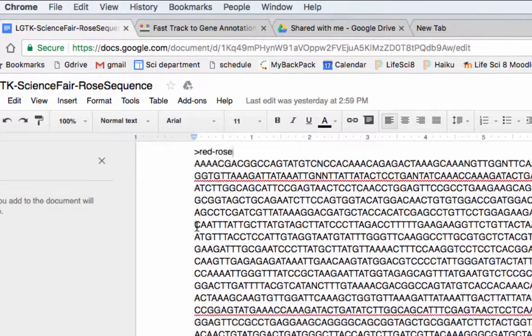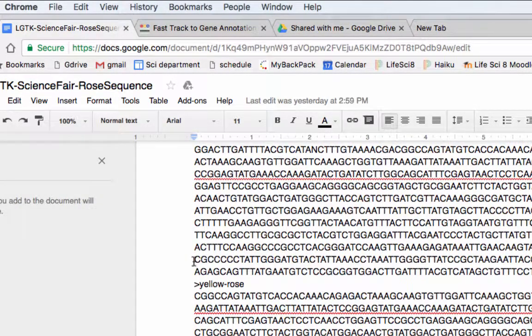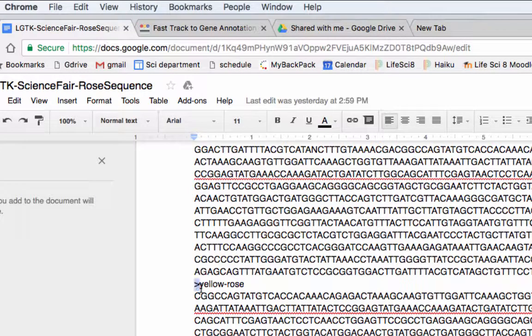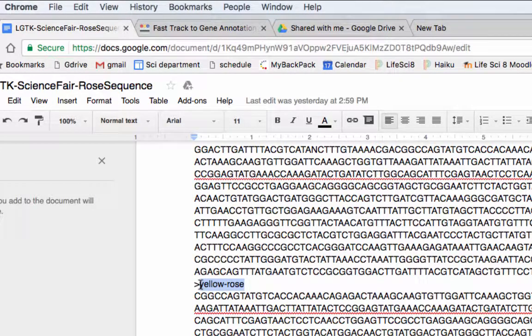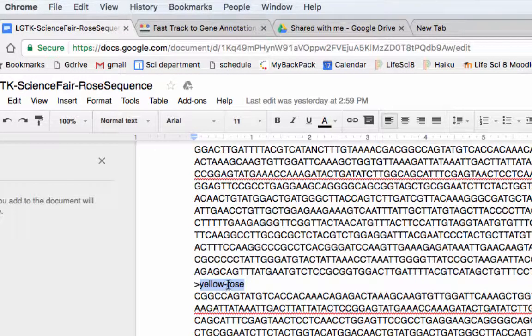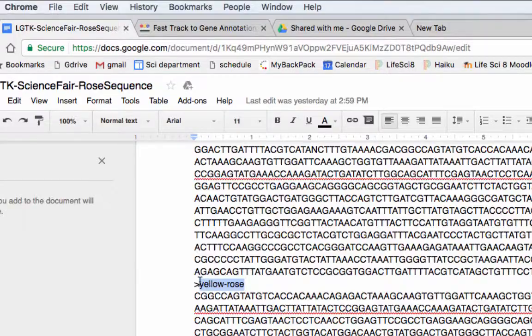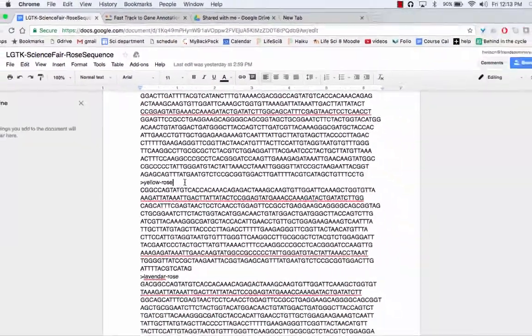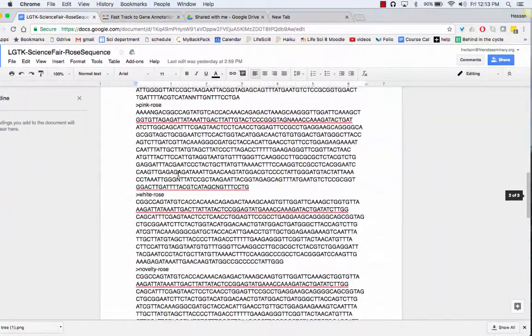Then you paste your DNA sequence. And then for the next sequence, again, the greater than sign and then its name. Make sure there are no spaces in the name. So if you wanted to specify two words like yellow rose, you can put a hyphen or combine them in some other way. And then the rest of the sequences here.